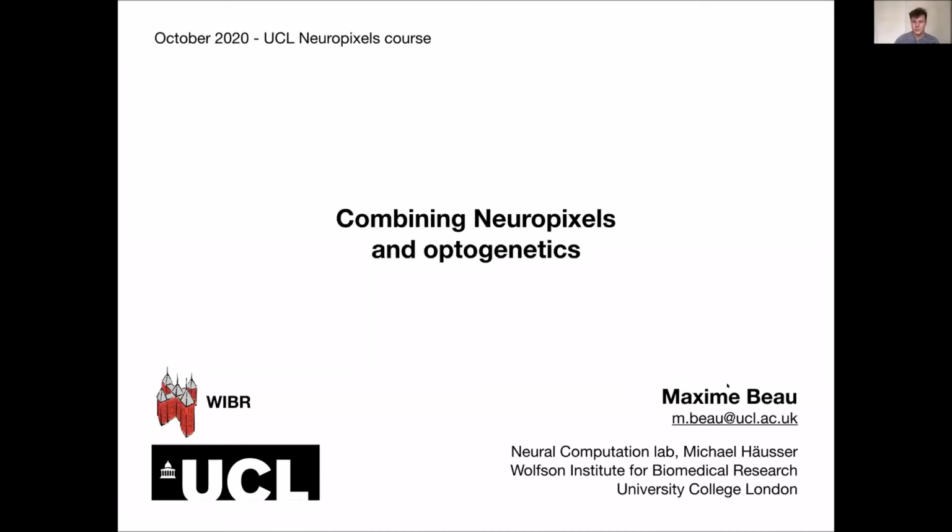So yeah, indeed, I'm a student in Michael Hausser's laboratory at University College London, and I've been working with Neuropixels probes for 3 years now, most of the time combining them with optogenetics. These recordings aren't really different from the regular Neuropixels recordings that you have heard about over the past few days, but they have a few specificities which I think are important to keep in mind when you're analyzing your data, if you want to properly be able to interpret it.